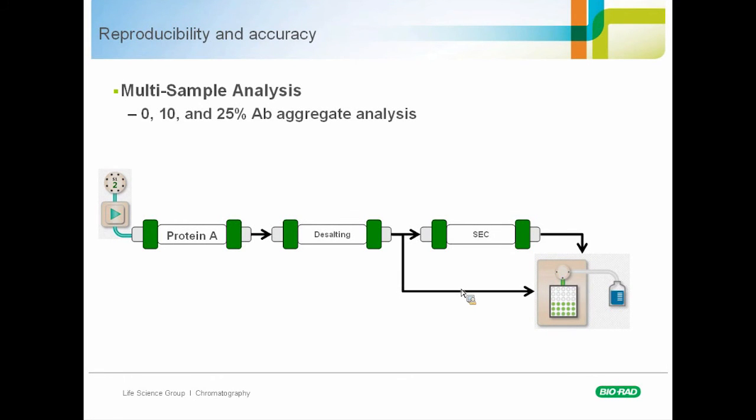This helps us identify which is our protein of interest. And as those of you who have done IMAC know, when you elute with imidazole, imidazole absorbs at 280. So this can also give a signal in the elution phase that doesn't correspond to protein. It's simply imidazole. So having the 2 wavelengths just helped us determine which was our peak of interest.